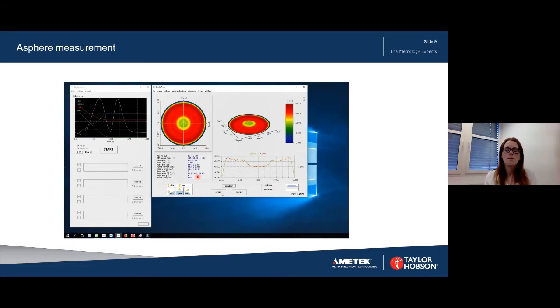So as you can see, measuring an asphere is quite straightforward. You just need your aspheric description. You need to find the height at least once. Maybe you need to do some alignment if your part is not on an expansion arbor, but we have the alignment help, LuphoStraight, for that, and then you can do the measurement and get your result.